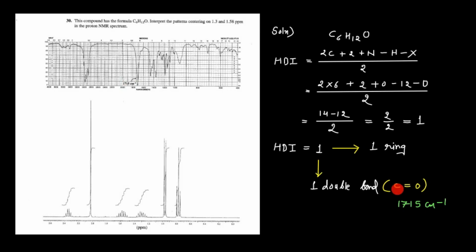So you have identified this C=O. Then if you quickly see your proton NMR spectrum, you have a singlet resonating at somewhere around 2.0 ppm. Its integration is quite high, which means these are 3 protons, and these 3 protons give only one singlet. It clearly indicates that it is connected with the carbonyl group, as its chemical shift also shows. So this fragment you have confirmed: CH3–C=O.